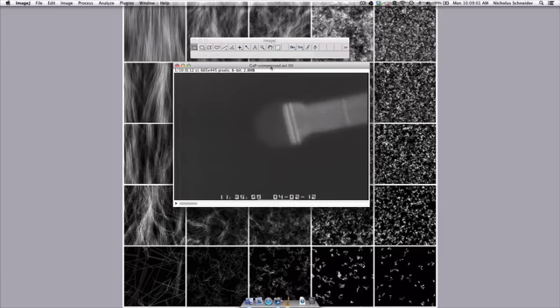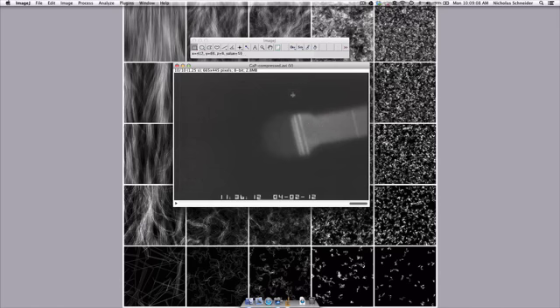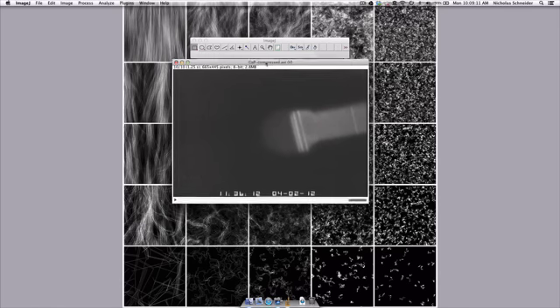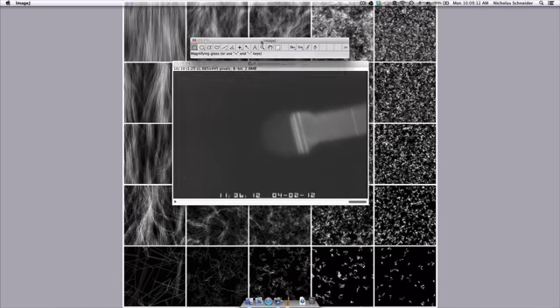Alright, so here we see we have our nanowire, and if we move through each of these frames you'll see that there's some small translation, and in the very last frame there's a large jump. And we want to correct for that so it looks like the nanowire is staying in the same place.